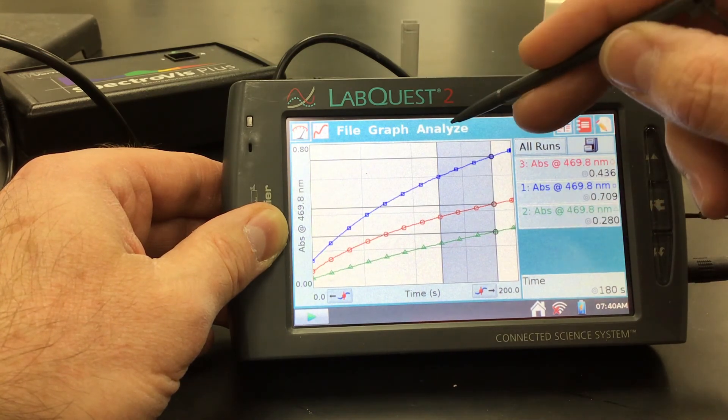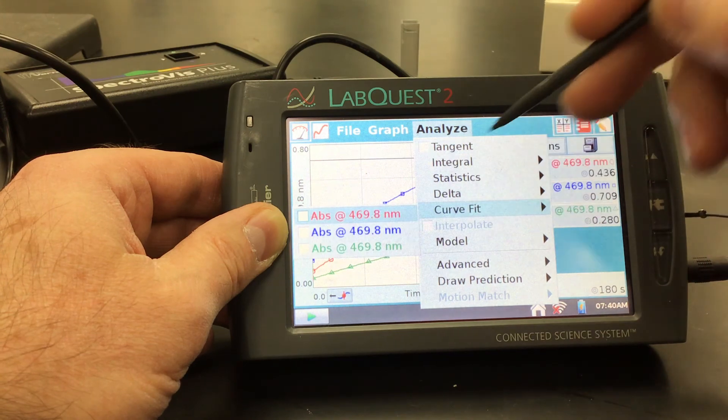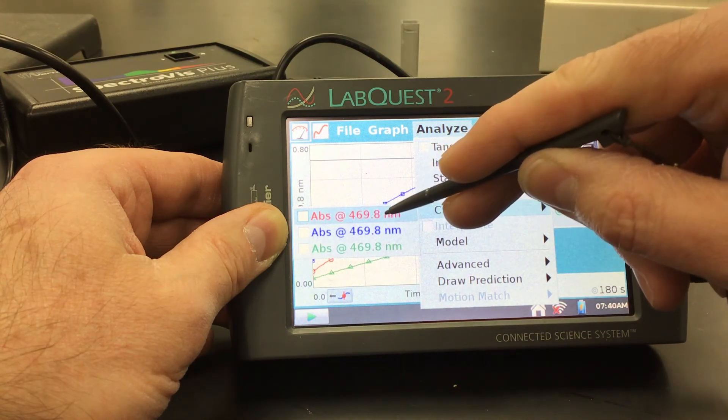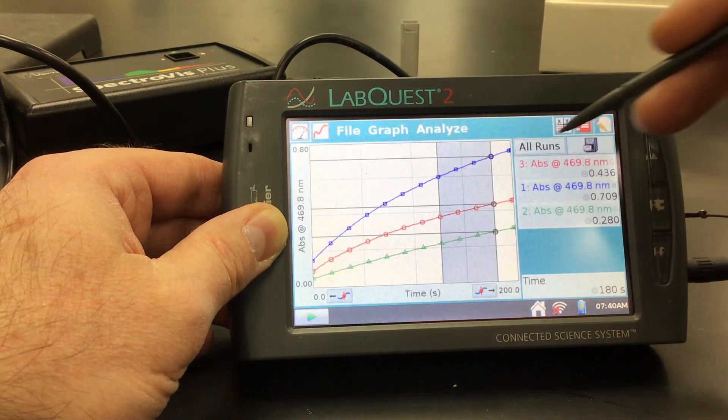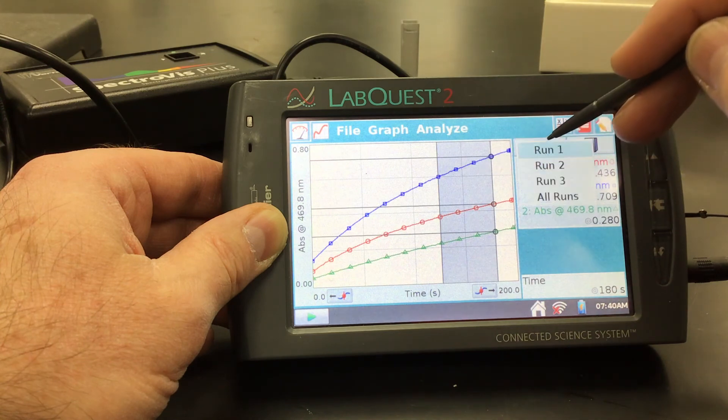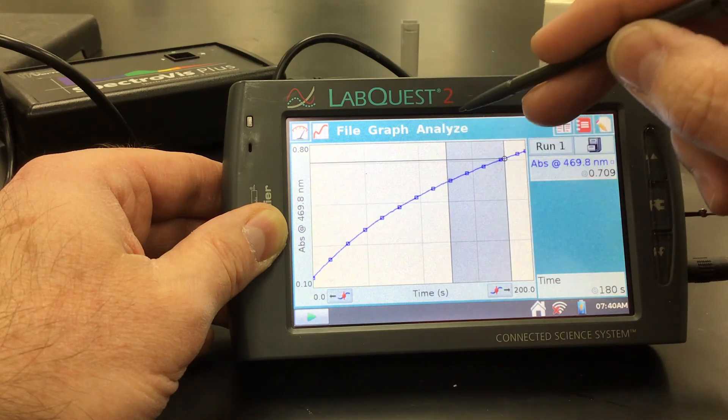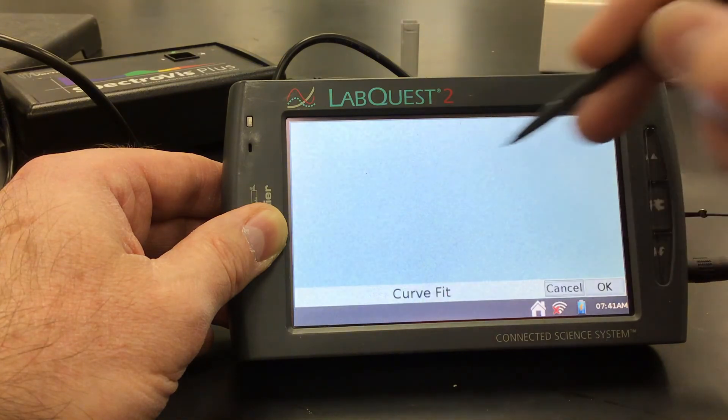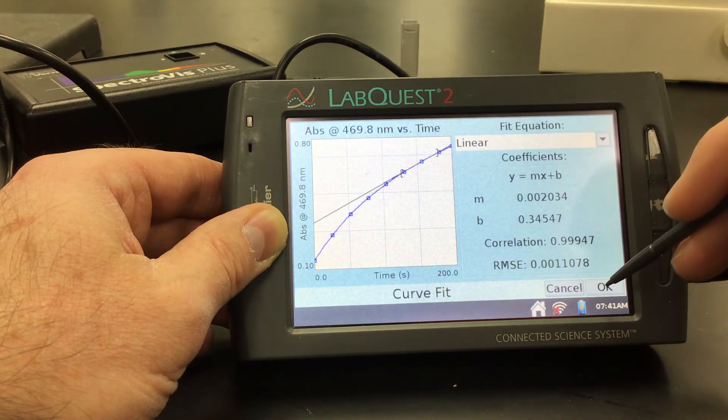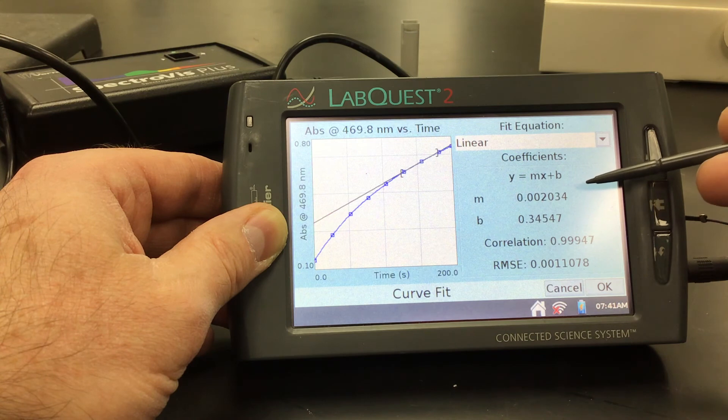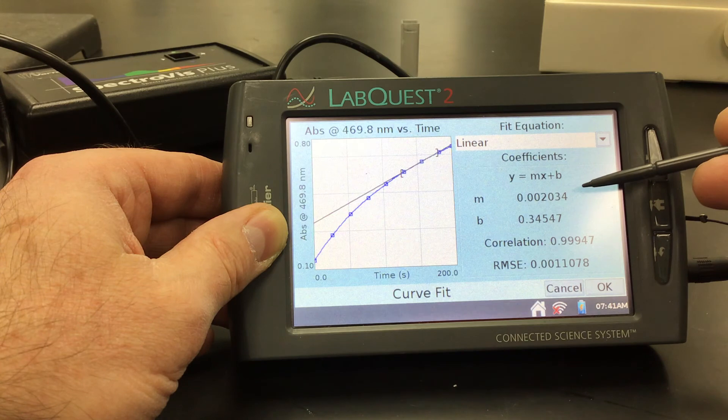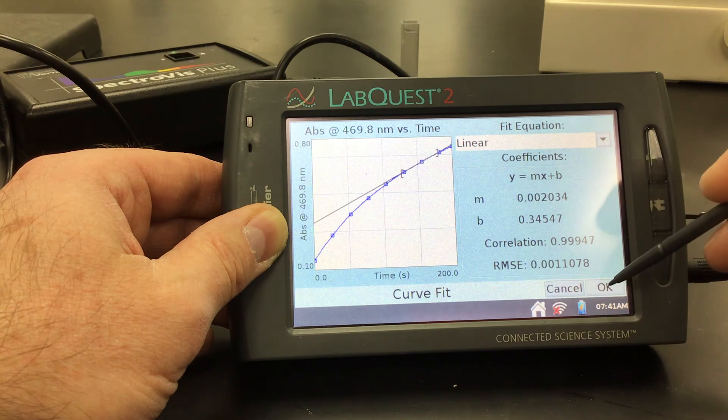So once we do that, what we can do then is analyze and then do a curve fit. And I'll just do the first one here and I'll do a linear fit. And this actually maybe is easier to see if we just show that like the first run here. And then, so the first run, let's do a curve fit to make it linear. And what we want to do is we want to record the slope. The slope is our initial rate. So for our first one, for our first run, we're going to record the slope or our initial rate as 0.002034. All right. That's going to be our first one there.